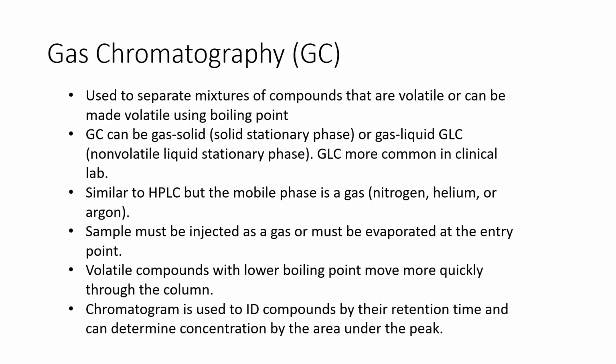A chromatogram is used to identify compounds by their retention time, and they can determine concentration by the area under the peak, similar to how you can do that with HPLC.